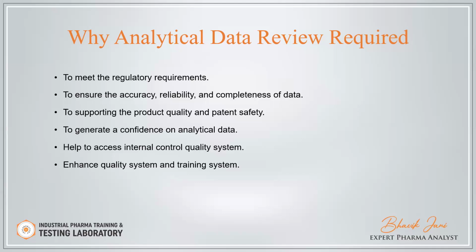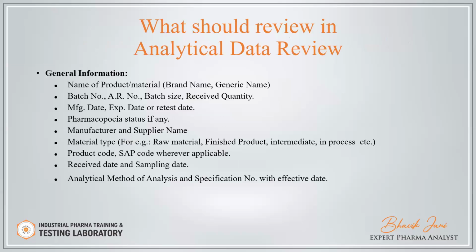So analytical raw data review is required to generate confidence in our generated data, and by reviewing the data we can enhance our quality system and we can provide training to the analyst for better performance or better enhancement.